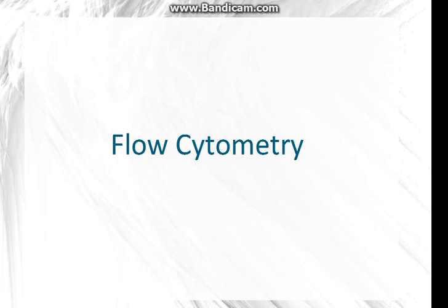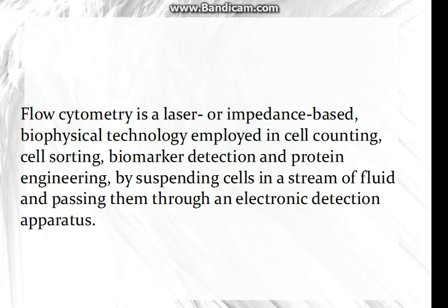Hello everyone. Today we will understand about basics of flow cytometry. So what is flow cytometry? It is a technology which is used for cell counting and cell sorting.